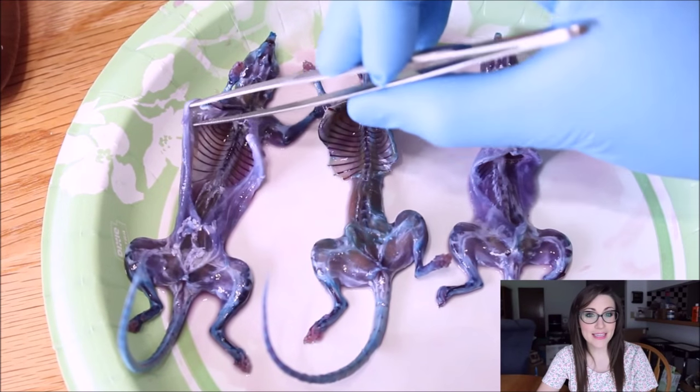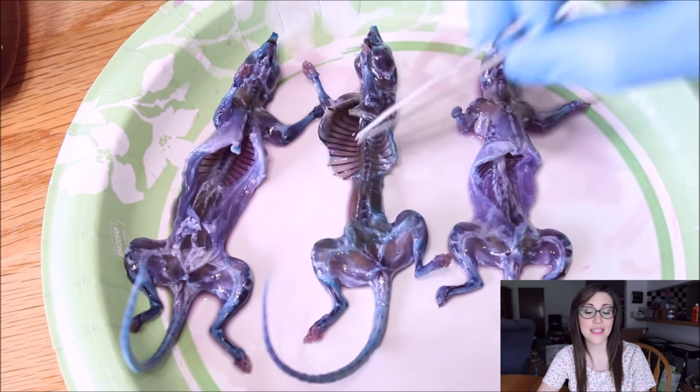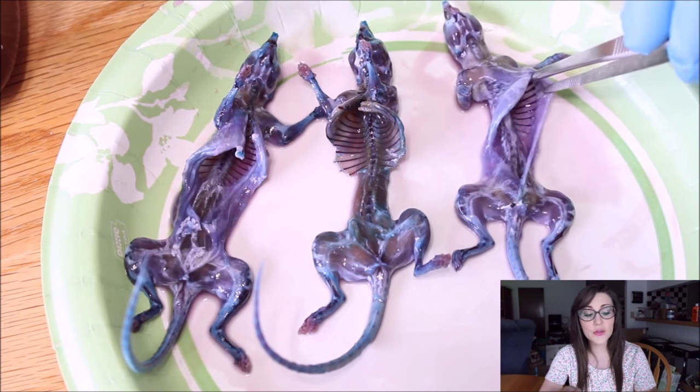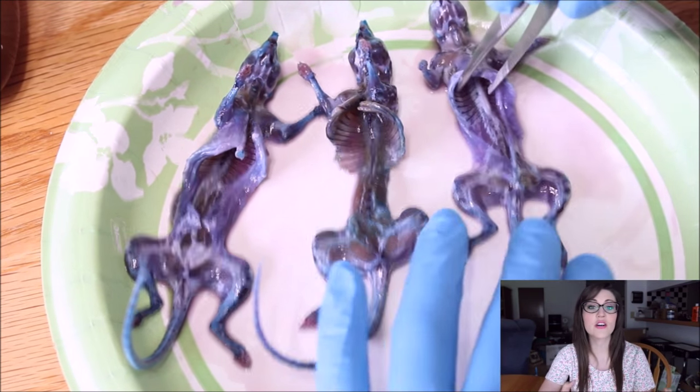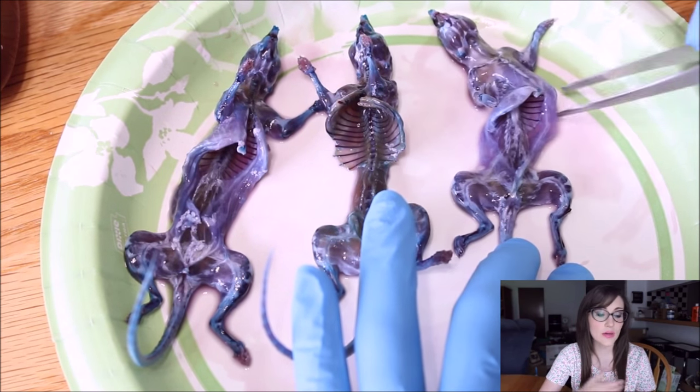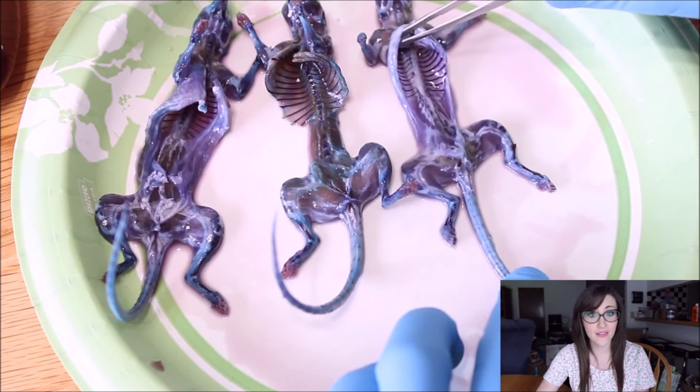We're going to take a look at what our specimens look like after being in the alizarin red stain. They've been soaking in there overnight so I'm kind of excited to see what they look like now. Looking at the mice after the alizarin red bone stain, I'd say my specimens turned out pretty good. You can clearly see where the bone stain took up most of the bones — it dyed the skull, it dyed the tail, it dyed the ribs, it dyed the arms and all of that.